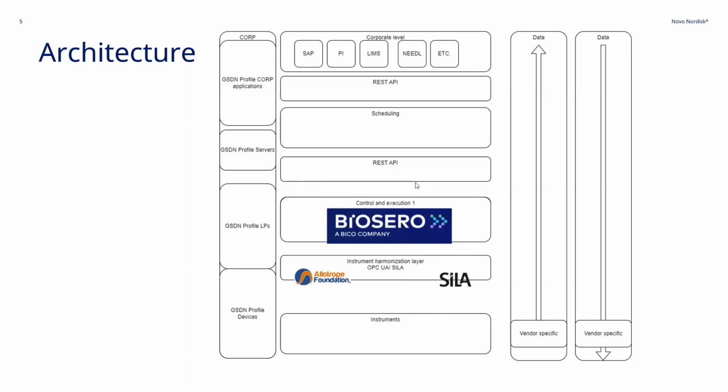And then the rest of the integration through the control system is not done yet. It's done to the minimal degree that it actually writes to LIMS, but it's also open. It's a REST API based control software. So whenever we want to do more integrations from this same application to other applications, we would be able to do it.